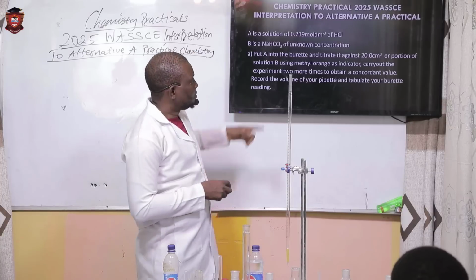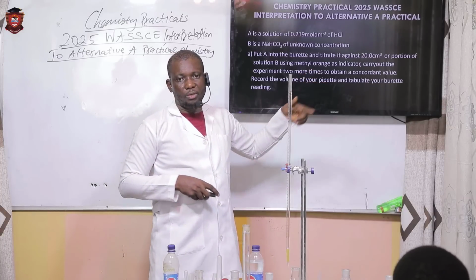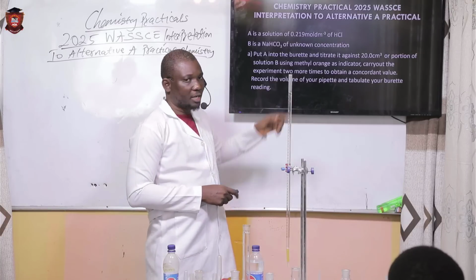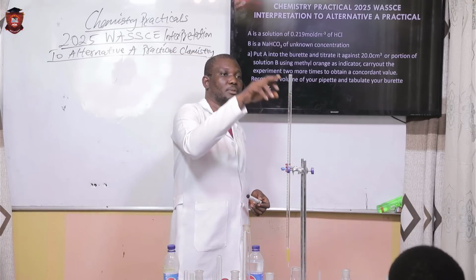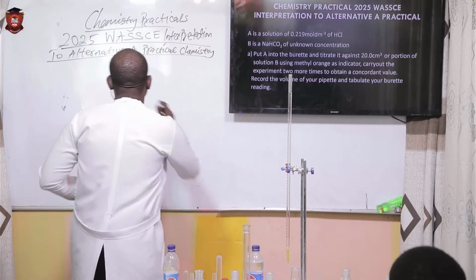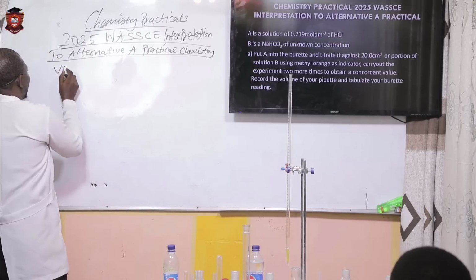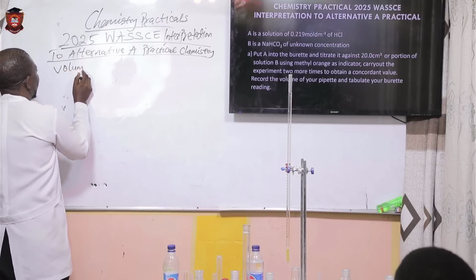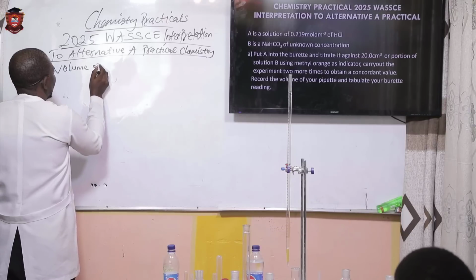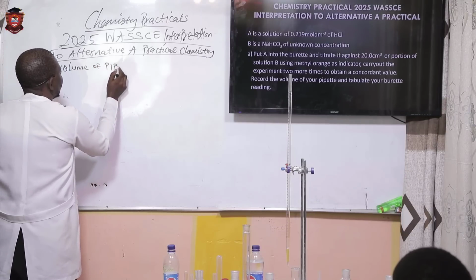If you fail to record the volume of your pipette, you may lose 1 mark. Make sure you don't forget that before you even read this burette to take your initial reading. Make sure you write down the volume of your pipette in that part of the question paper.